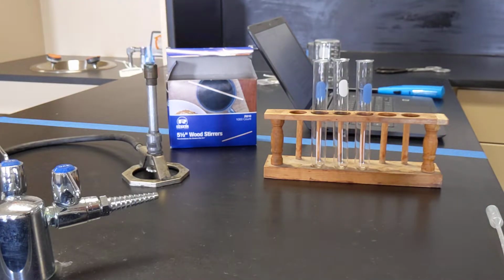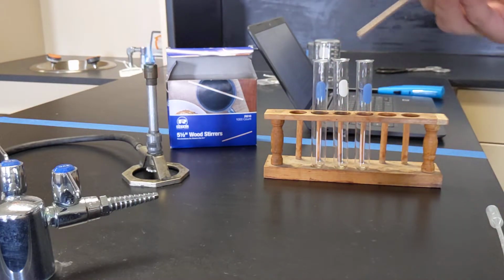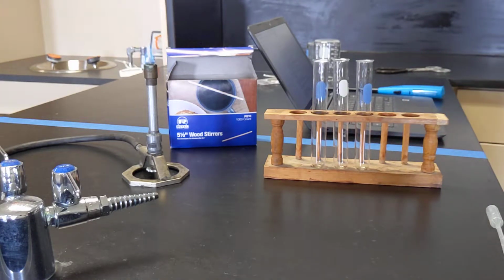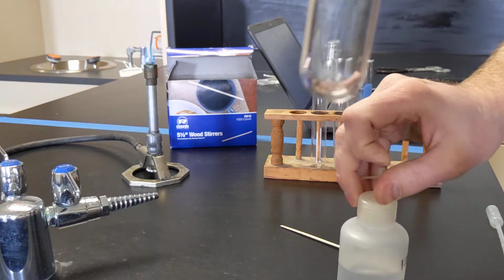If it's oxygen, fire needs oxygen to burn, so the red hot stir stick should glow more. But oxygen itself is not flammable. It just allows other things to burn. So it's not actually going to set on fire. It's not going to ignite as if it were hydrogen gas. Carbon dioxide is an inert gas, which means it doesn't really react. So if that's the case, it should put out all of the smoldering embers on the stir stick, and then it should just smoke a whole bunch and not be glowing red anymore. It'll basically put it out. So it's either going to explode, it'll burn more, or it'll go out completely, and that will tell us which gas it is. So I have the magnesium here in the tube.